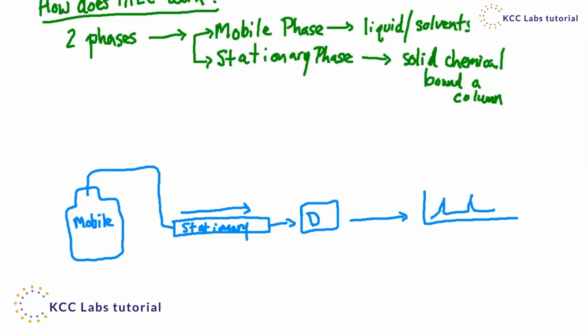And those different times, referred to as retention times, are how we can identify what is coming off of the stationary phase or the column. All right, so a mobile phase is oftentimes going to be a mixture of water and organic solvents. And the polarity of the mixture, or the lack thereof, because you could certainly be working with nonpolar ones as well, will determine how long the compounds are going to stay on the column or adhere to the column, and that's known as retention time.